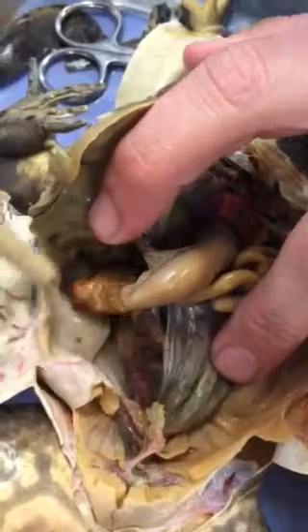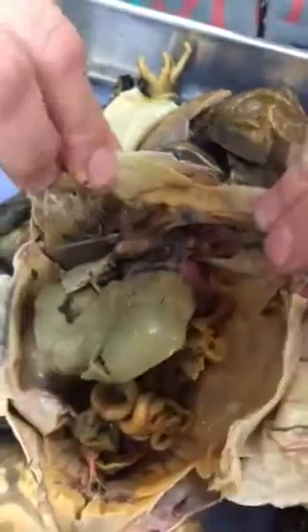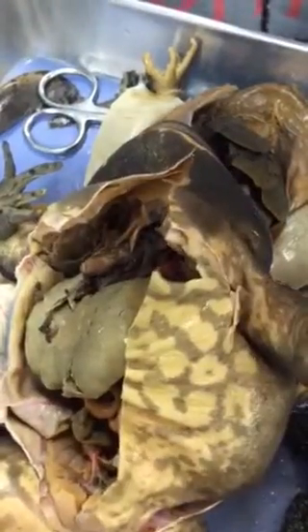So the kidneys sometimes have this pink color. This particular lung has some pink color to it as well. So I think that's it.